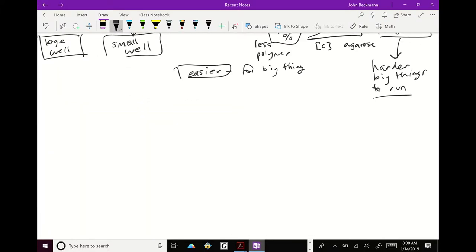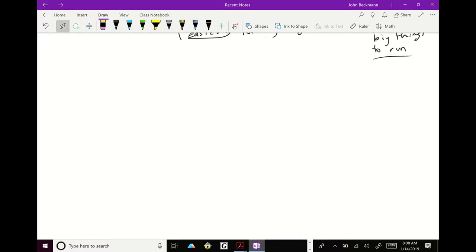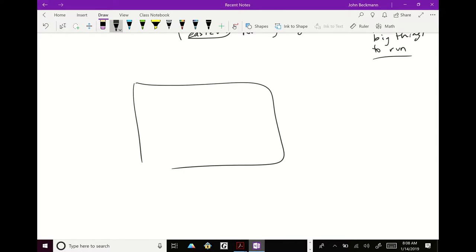Okay, so here's another problem. If you look at the lecture notes, for each of these types of experiments, I have outlined what you can get out of these experiments. So if you run an agarose gel, it says here, you can visualize the presence or absence and the size of specific constructs or PCR products. So these are, again, nucleic acids, right? If you make a plasmid, you can look at the size of that plasmid or the shape in so many ways on an agarose gel, or you can measure the size of your PCR products, okay?